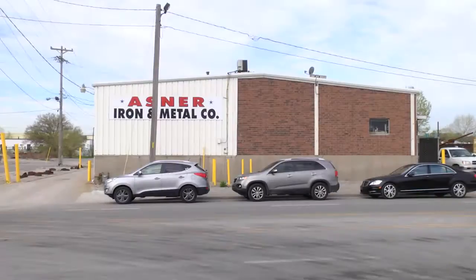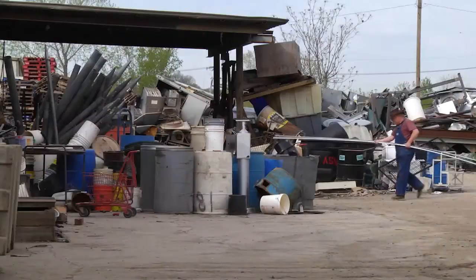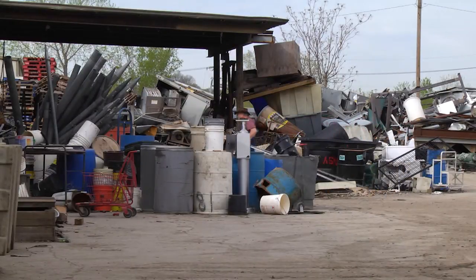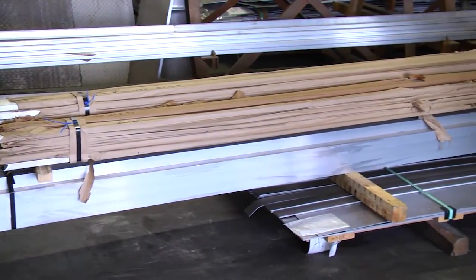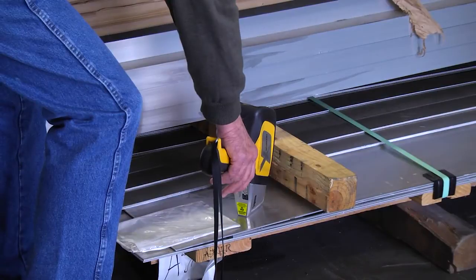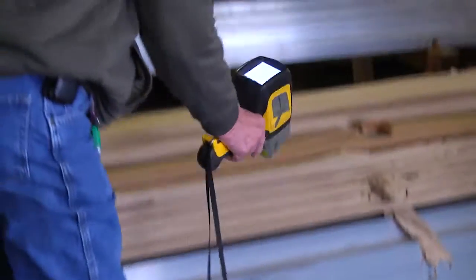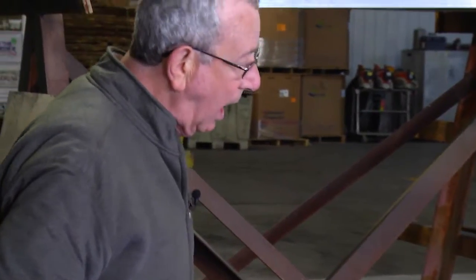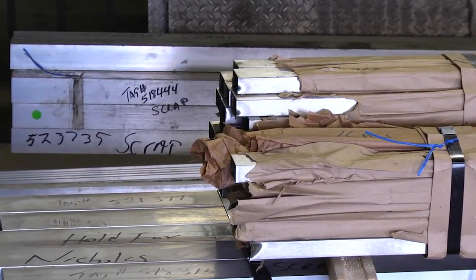The gun takes all the question out of it. At the beginning of the day, we start to receive product in and we get everything in from pallets to banded material such as this. We'll take the analyzer and just do a quick test on the material. After it runs its first scan, we realize what the material is, and I'll identify it with a magic marker so we can segregate it as we go through the pallet.